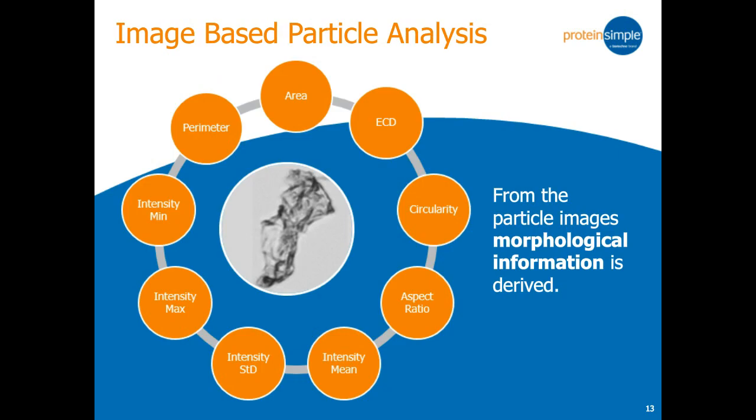MFI has brought a new level of information to the analysis of subvisible particles by providing image-based analysis. So this is a sensitive approach which allows us to take pictures of particles and then quantify morphological information that can be associated with that picture.